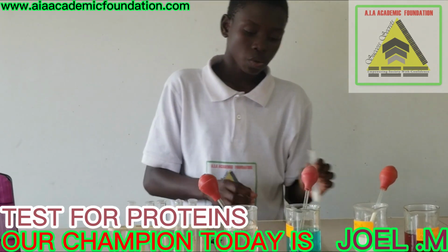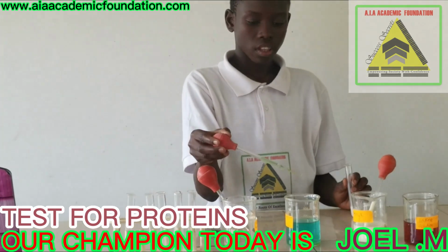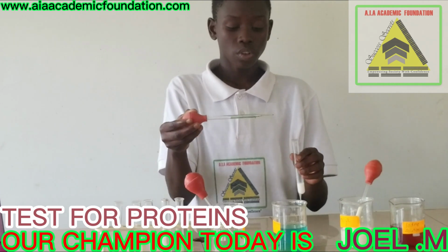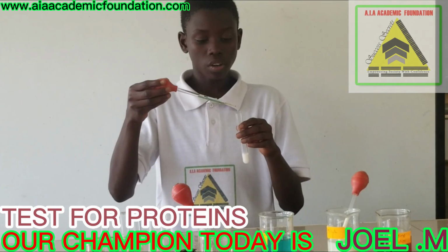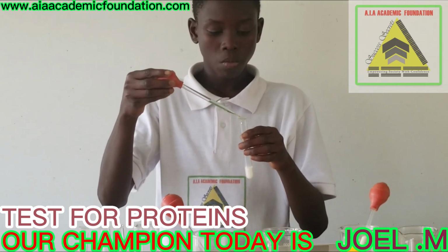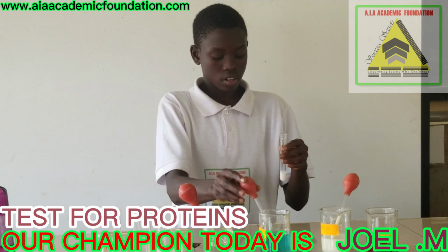After that, we shall get our dropper, and then we add 2 to 3 drops of copper 2 sulfate, which has the color of blue. So I'll add 3 drops. Then after that, we shake.